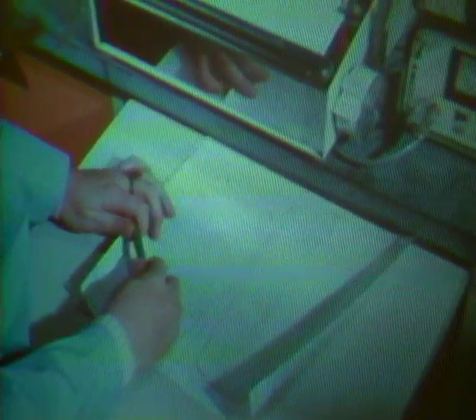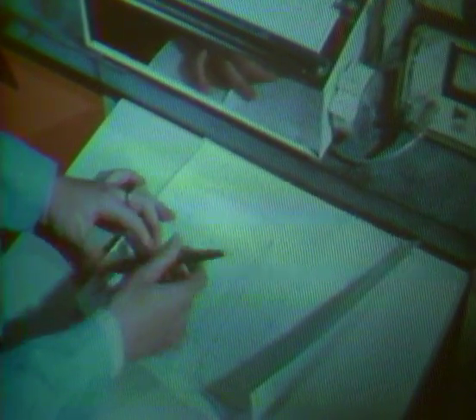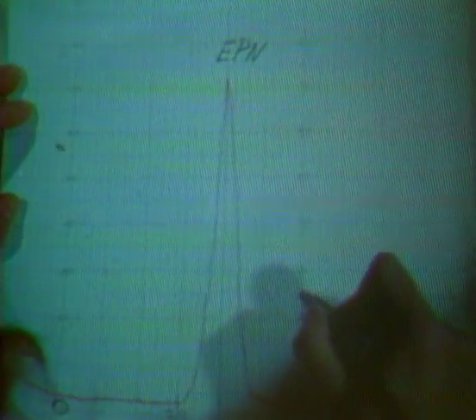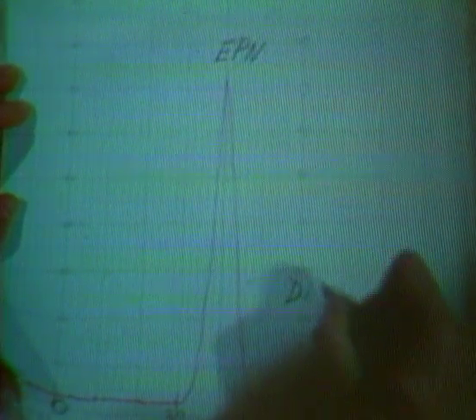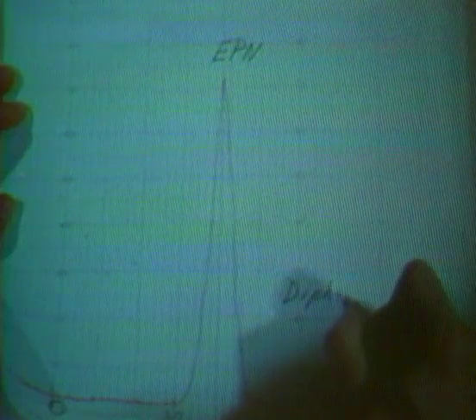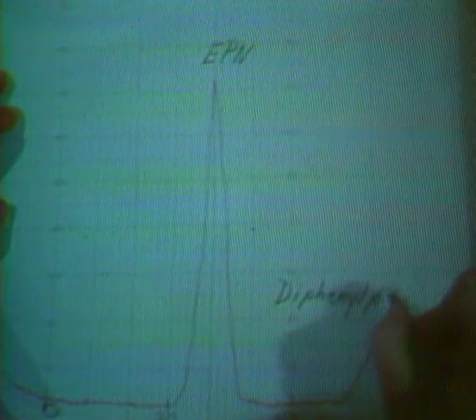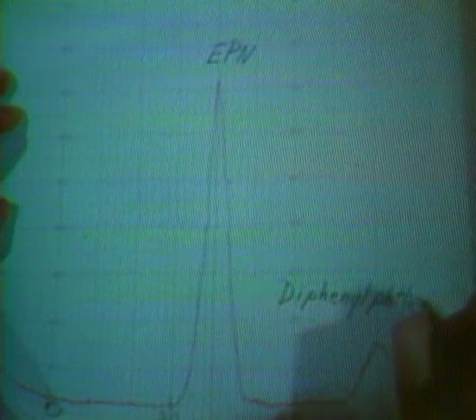Modern liquid chromatographic methods now approach the speed and resolution of gas chromatography. For example, this 90-second separation of the insecticide EPN was obtained on a 1-meter column 3 millimeters in diameter. The mobile phase was hexane, and the stationary phase 1% oxydipropionitrile on beads having controlled surface porosity.